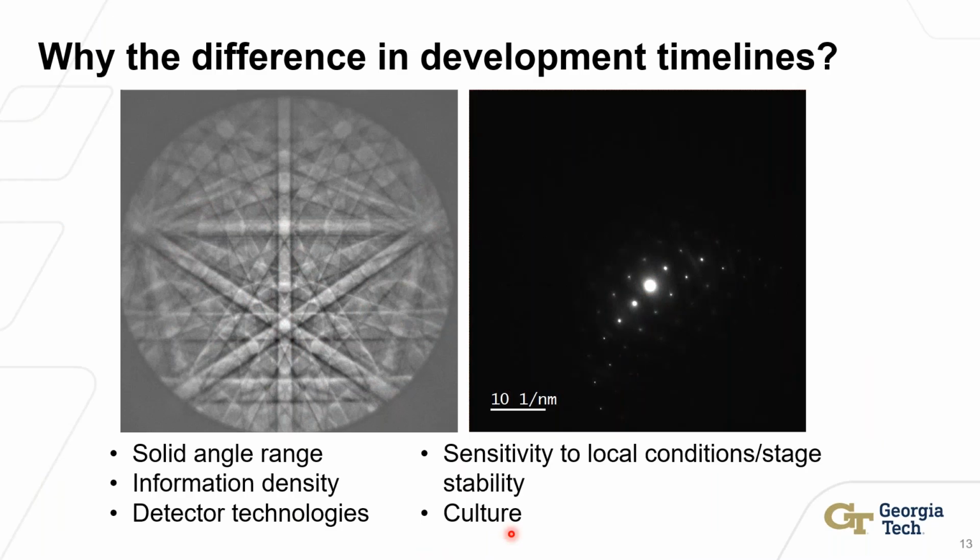And finally, and this is more opinion, but culture itself, I think in the TEM community, there's been this stronger drive of really having an expert user of the TEM, right? Spending hours down there in the basement, applying your trade, learning the tips, the tricks to get really beautiful images. SEM was seen more of an easy technique. And in some ways that lowered barriers to bring in these automated techniques, where with EBSD essentially, you just draw a box and press go and get a massive amount of data out.